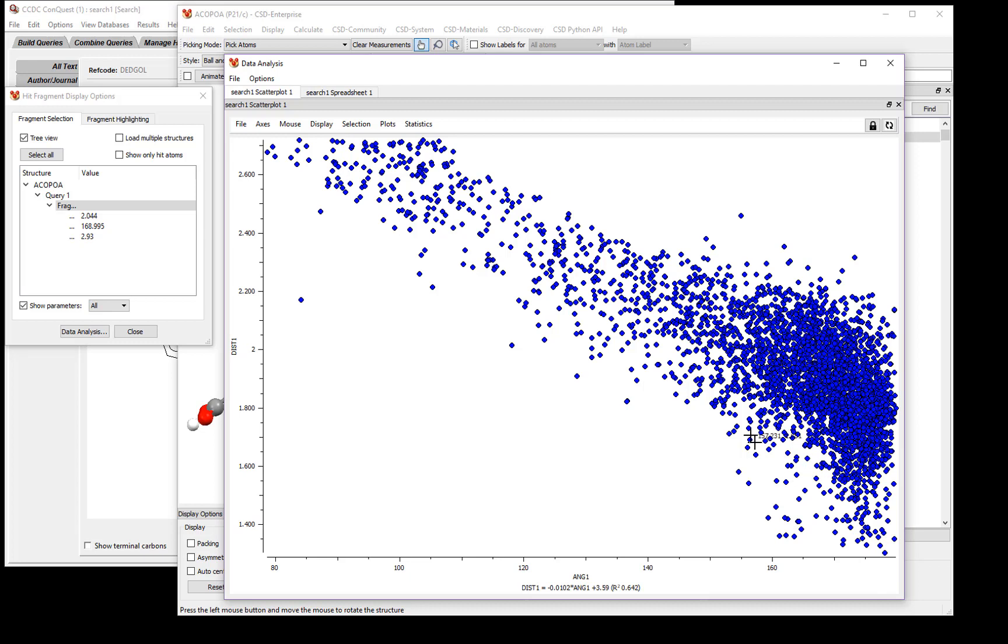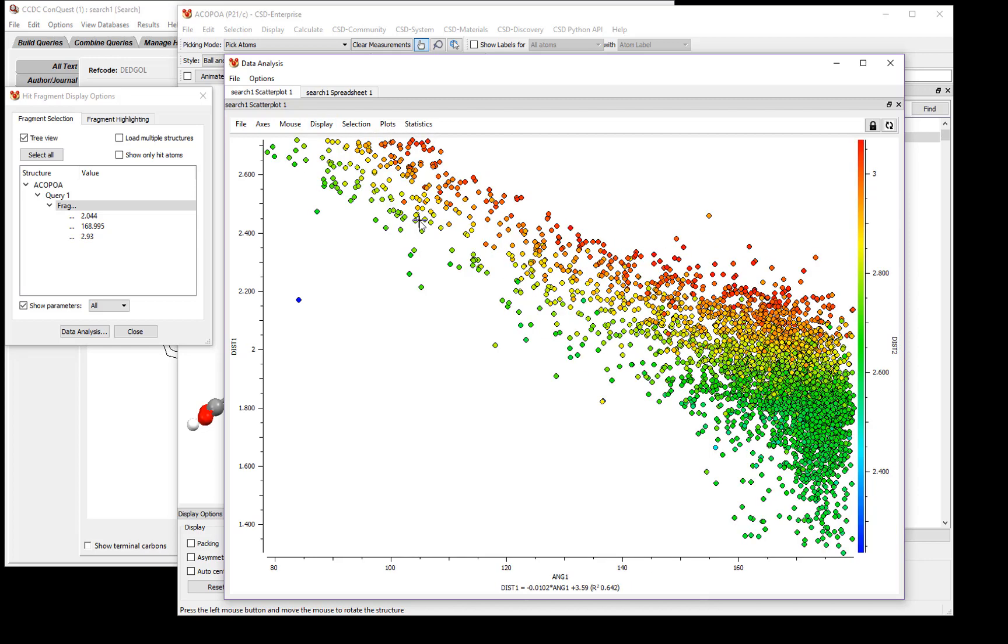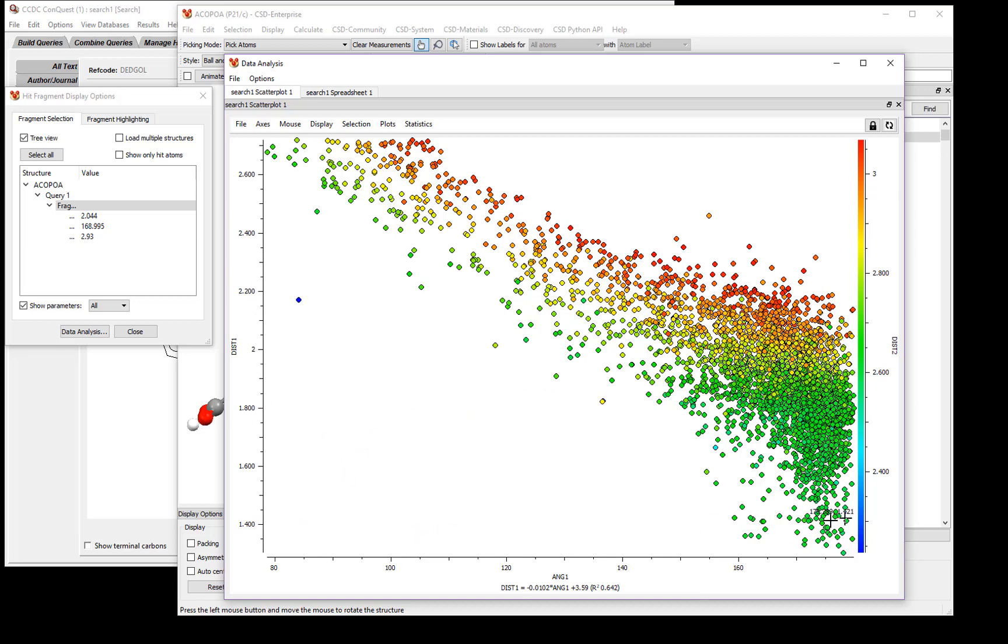Let's see how the distance between the donor and the acceptor looks relative to this data. To do that, click Display, then Colors, and select Distance 2 from the drop-down list. Here you can see the data are colorized based on Distance 2, or the distance between the donor and the acceptor. You'll notice that this distance varies as well as a combination between Distance 1 and Angle 1.